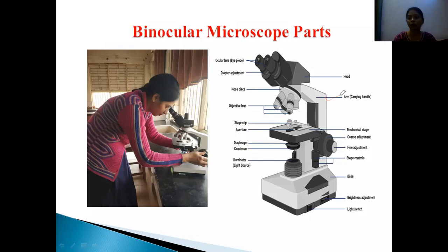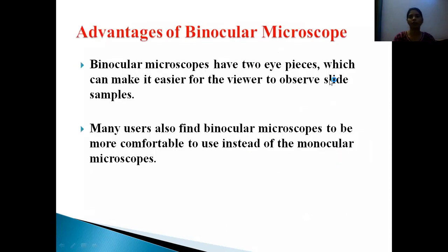This is the carrying handle used to carry the microscope from one place to another. The nosepiece holds the objective lenses, which include 10x, 45x, and 100x magnifications. The upper part is the head, and through the eyepieces we can observe the specimen, making it easier for the viewer to observe slide samples.